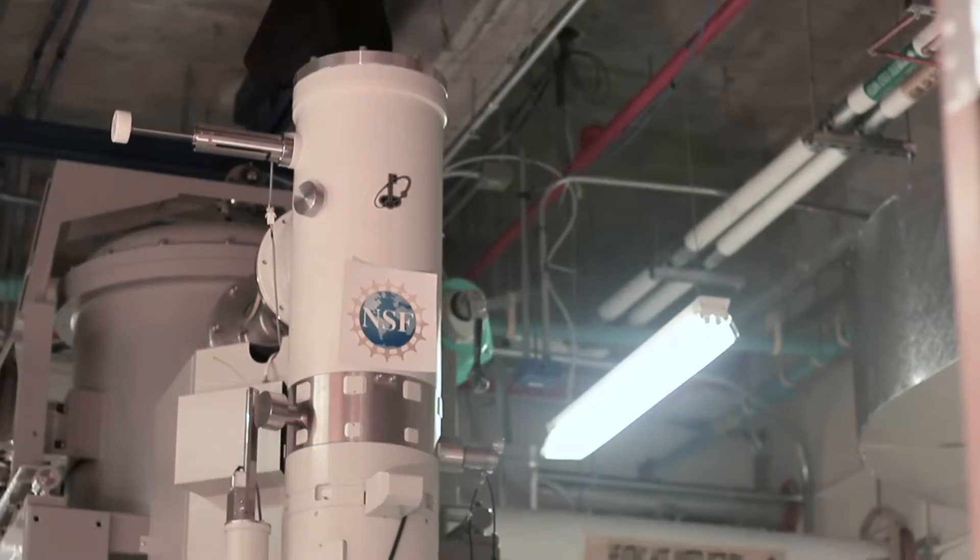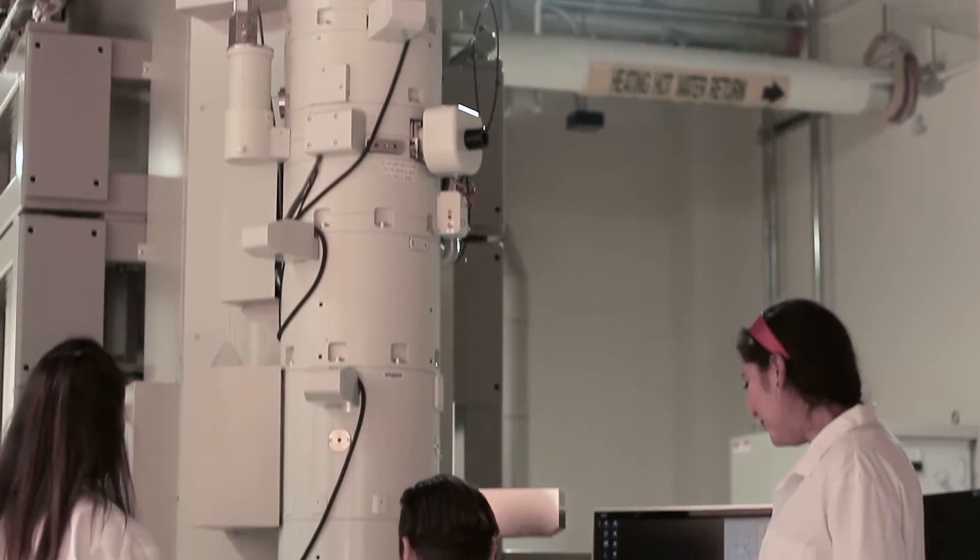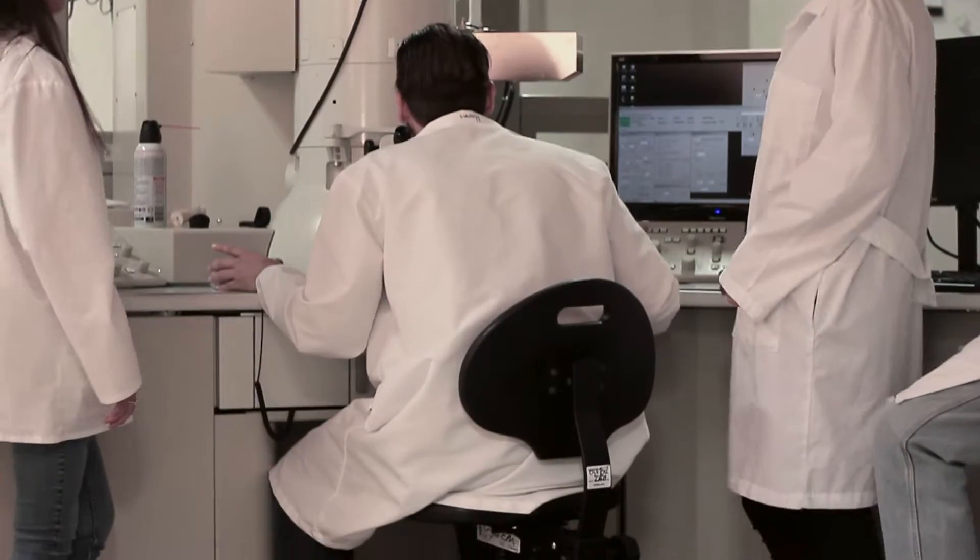And various other small instruments also that we use for the purification of proteins or to analyze them.